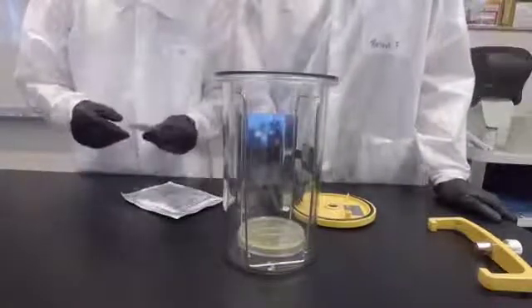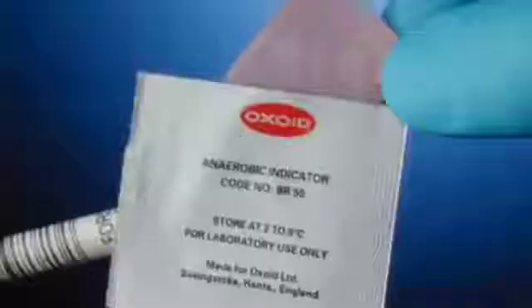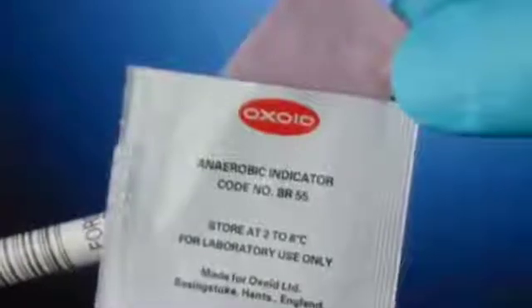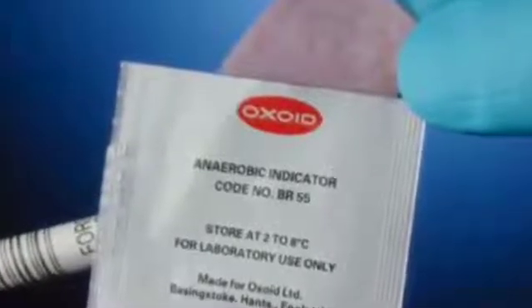We'll then take our resazurin indicator strip and place it on the inside wall of the jar. You want to make sure that this remains visible as it will serve as the indicator for when the jar is void of all oxygen.